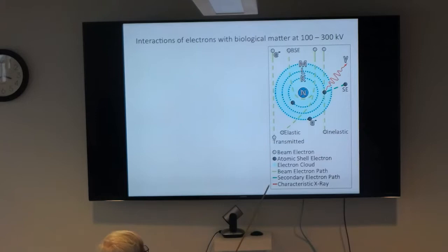Inelastic scattering is the opposite. Energy is dissipated, and it's being used in order to kick an electron out of the orbit. Ionization takes place, and the electron is essentially completely out of phase. It's randomly associated with the phase of the incoming electron. It doesn't give you information about the object. And for biological matter, there's more inelastic than elastic scattering. So the whole thing is very difficult to make use of. A very important thing is that the useful thickness is only in the range of something like 0.2 microns. Beyond that, you could consider the object opaque, essentially.